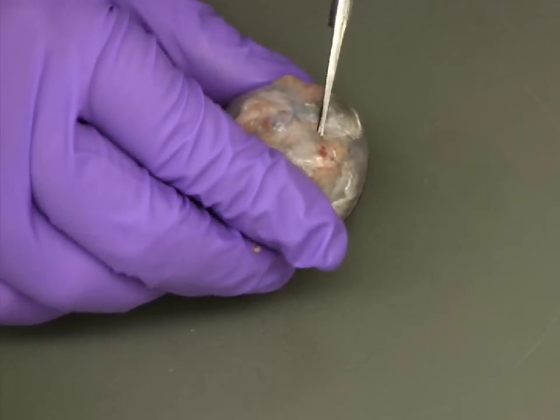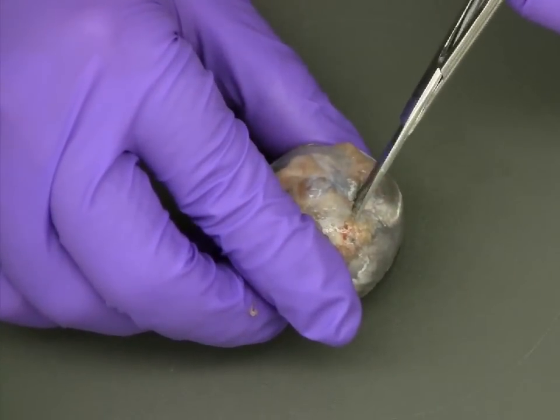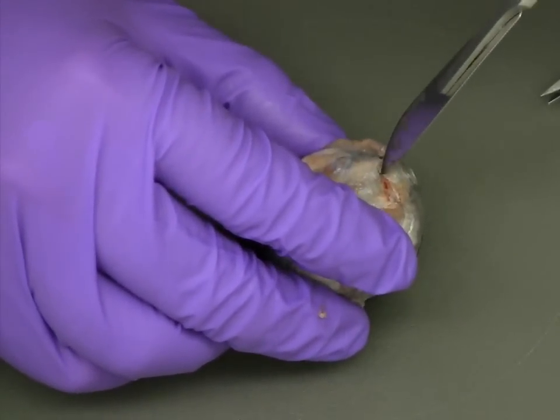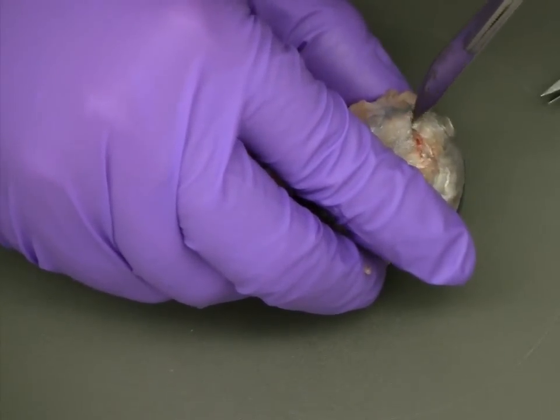Using sharp pointed scissors, you can create the initial opening which you will then use to complete the incision. If you have trouble starting the incision with the scissors and you wish to use a scalpel, use the blade to carefully create a small opening where you can continue to use the scissors.